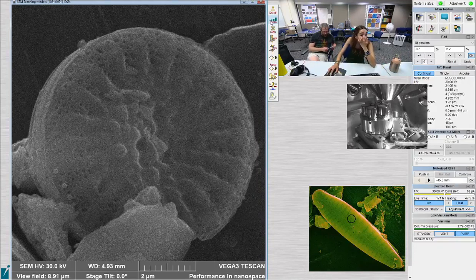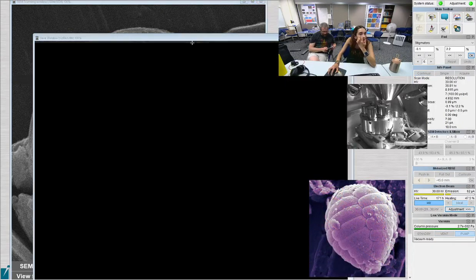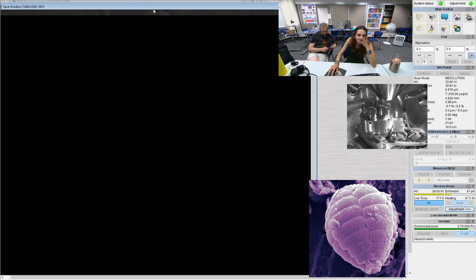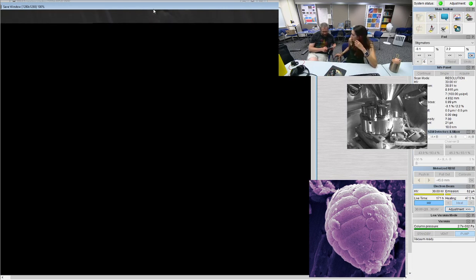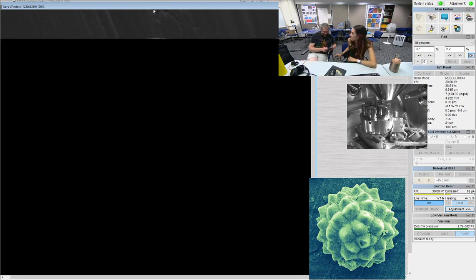You just got done moving. You're going to unpack your microscope and hopefully start back up on your ID work. Great. Anna says, I ID'd Spirogyra based on width and number of chloroplasts, seven different samples. I put them under a growth lamp, and two weeks later I have seven different species of Spirogyra. Excellent.